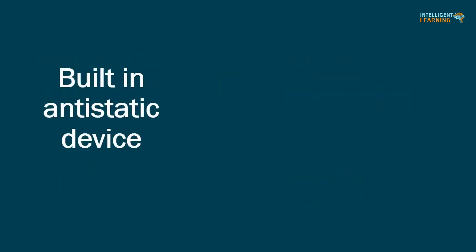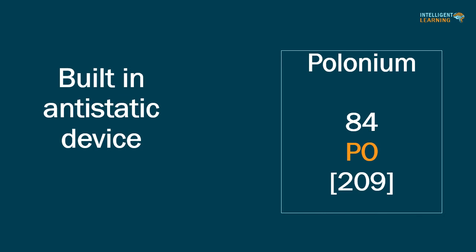Commercially available balances with a built-in antistatic device can be used to remedy the problem. Such devices may use piezoelectric components or a very small amount of a radioactive element, typically polonium, to generate a stream of ions that dissipate the static charge when passed over the powder being weighed. Antistatic weigh boats, antistatic guns, and antistatic screens are also commercially available.